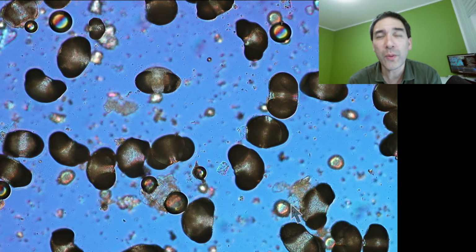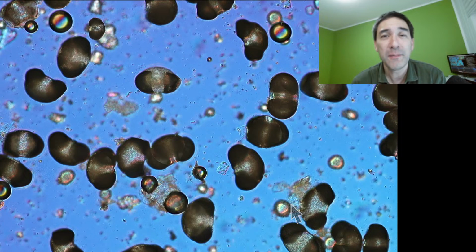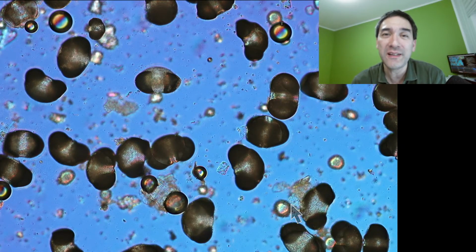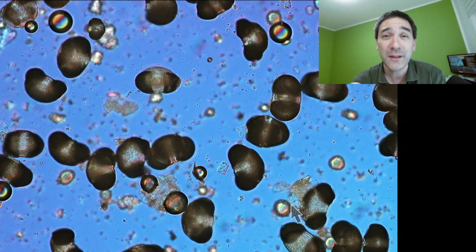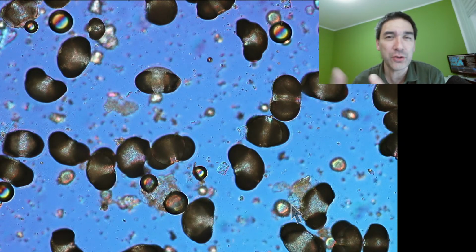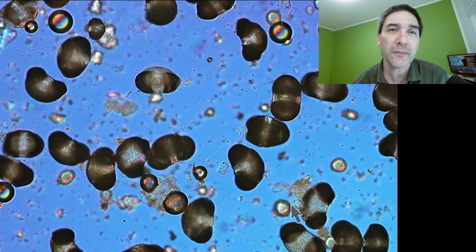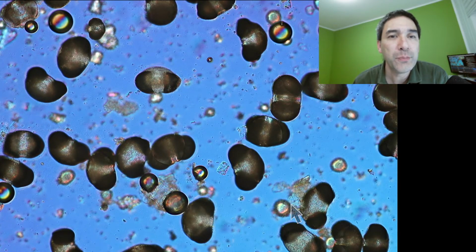I was wondering why this is the case, and I think the reason could be that exposed moss is exposed when the sun is shining. It dries up completely and is exposed to more heat. Now tardigrades apparently are quite resilient to drying, but they don't like heat. If it's too hot, they don't like that. So if you want to collect tardigrades, get the moss from a place that is basically a forest.